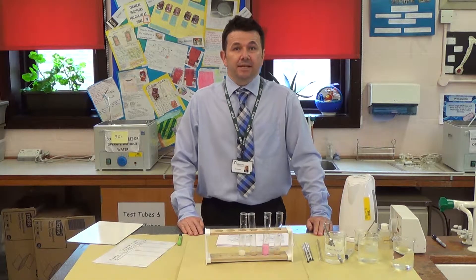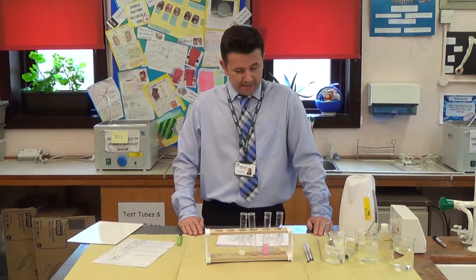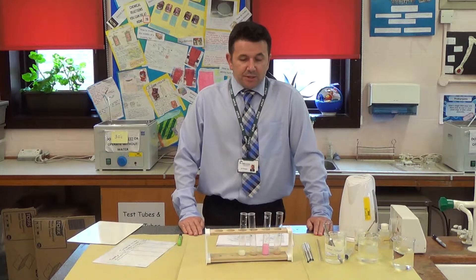This is GCSE Biology Required Activity 10. Today we're looking at investigating the effect of temperature on the rate of decay of fresh milk by measuring a pH change.